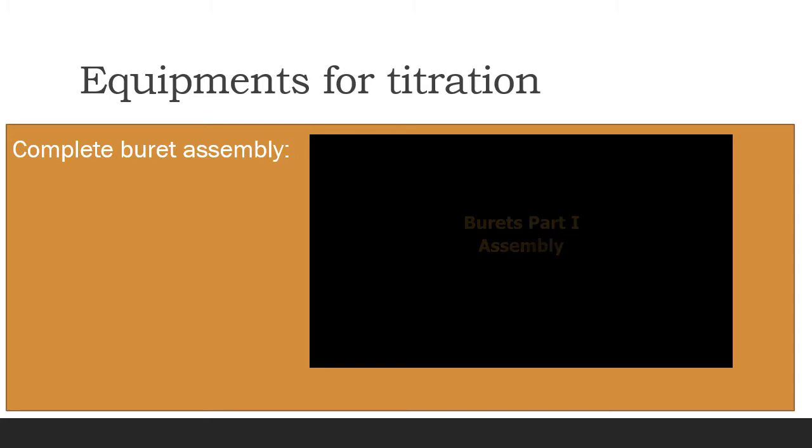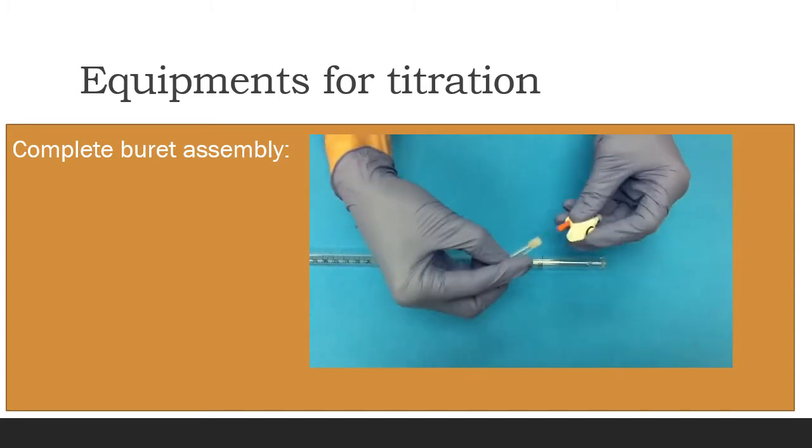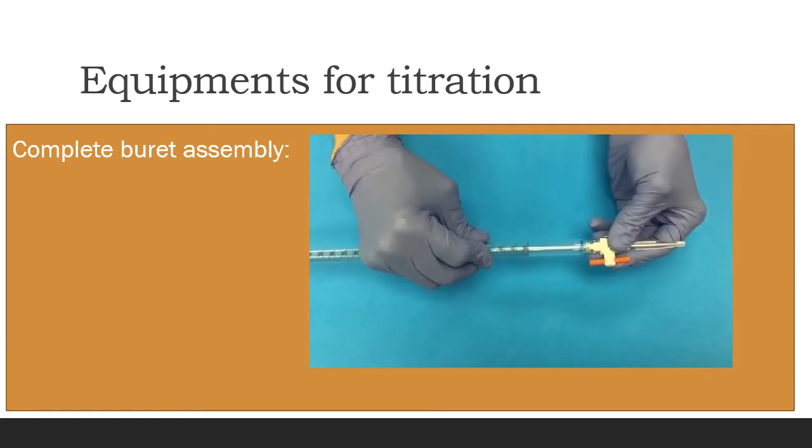In this video, we're going to show you how to assemble a burette. When you get your burette, it might be disassembled as shown here. If that is the case, you're going to want to follow the steps we show here to assemble the burette properly.